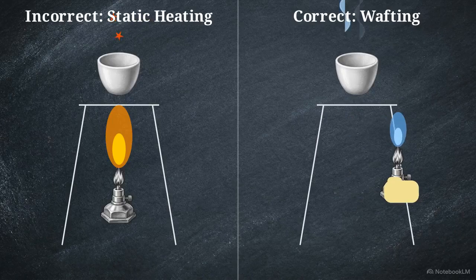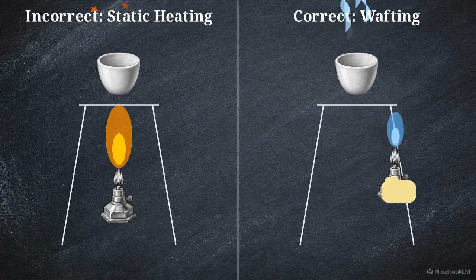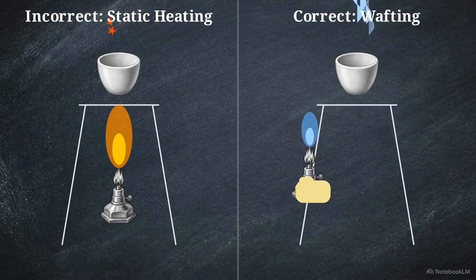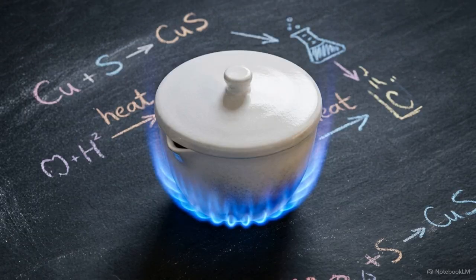To prevent this, hold the Bunsen burner firmly by its base. Regulate the temperature by continuously wafting the flame back and forth under the crucible, applying only enough heat to evaporate the liquid slowly. When the contents appear completely dry and the popping stops, place the cover securely on the crucible and apply strong direct heat for 5 solid minutes.